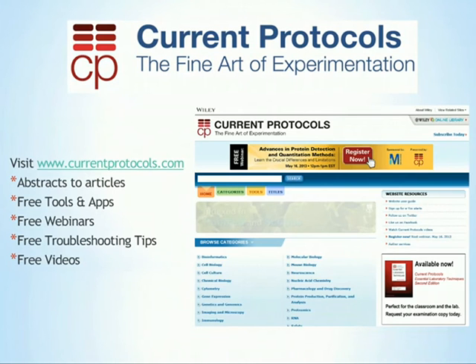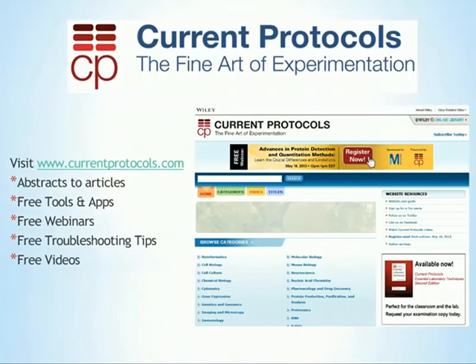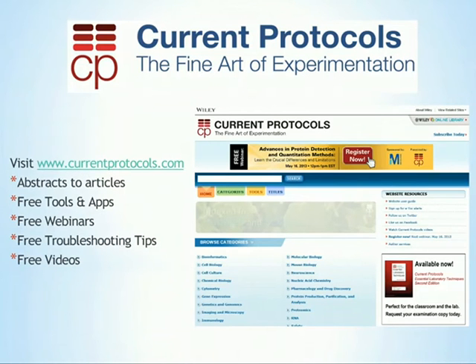Okay, and we have time for just one more question, and I found one here that seems pretty general but important. I believe this would be for Brian. It says, what is the best way to choose your control samples? Okay, so these are the samples that are used, as I mentioned, in each experiment set. Whenever you do an experiment on a different day, you want to have a small set of samples that you run every time, the same samples.